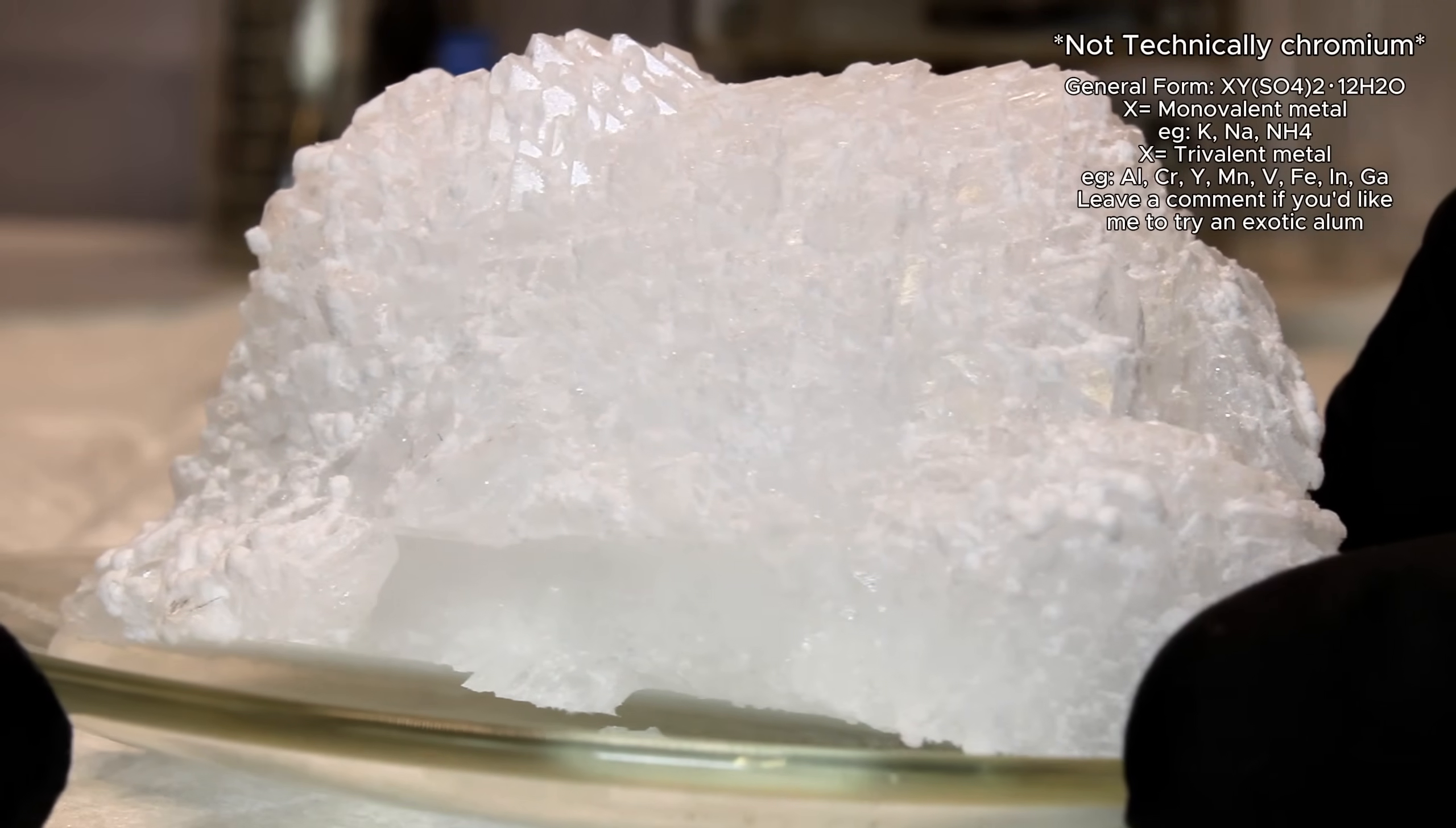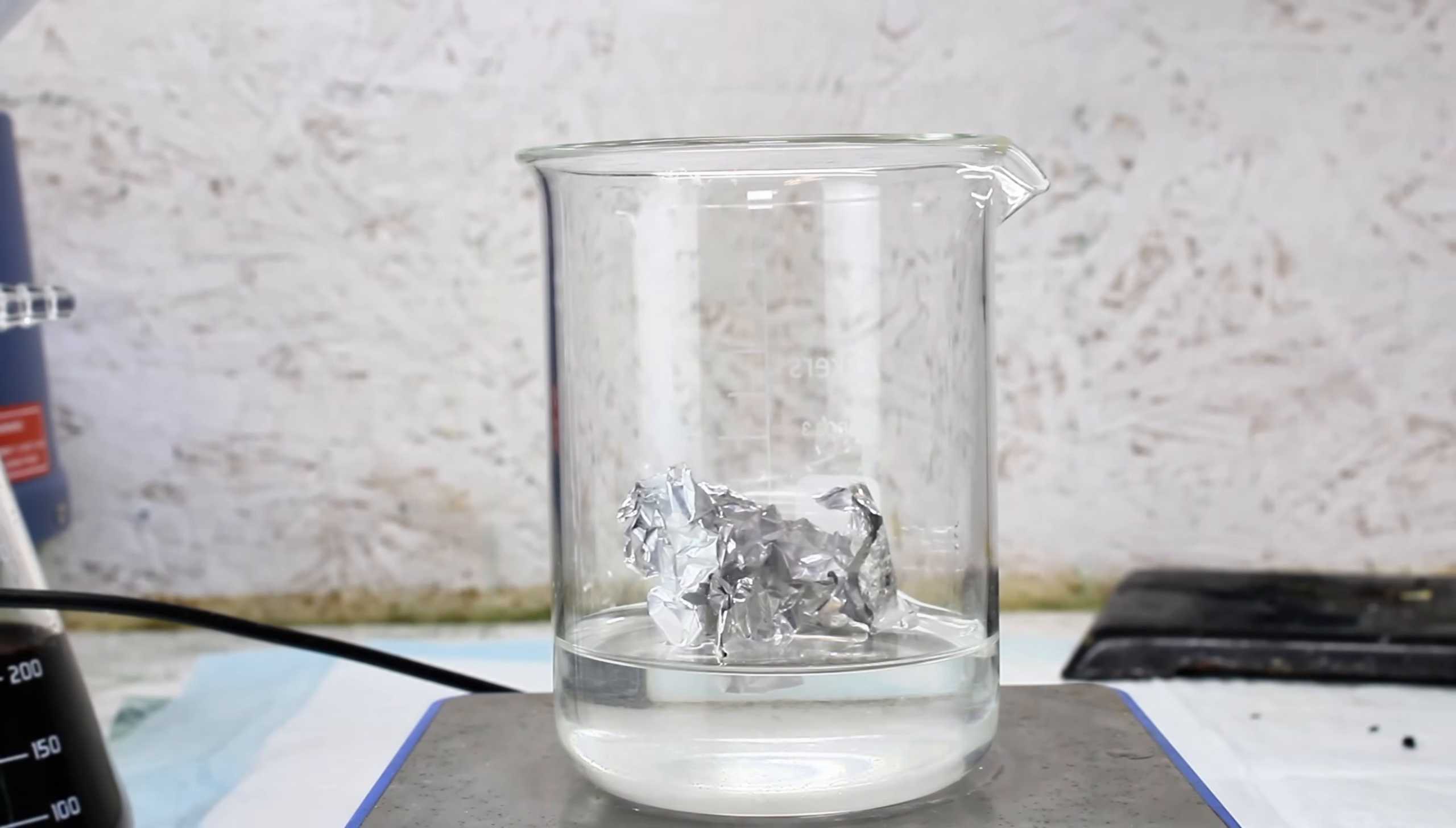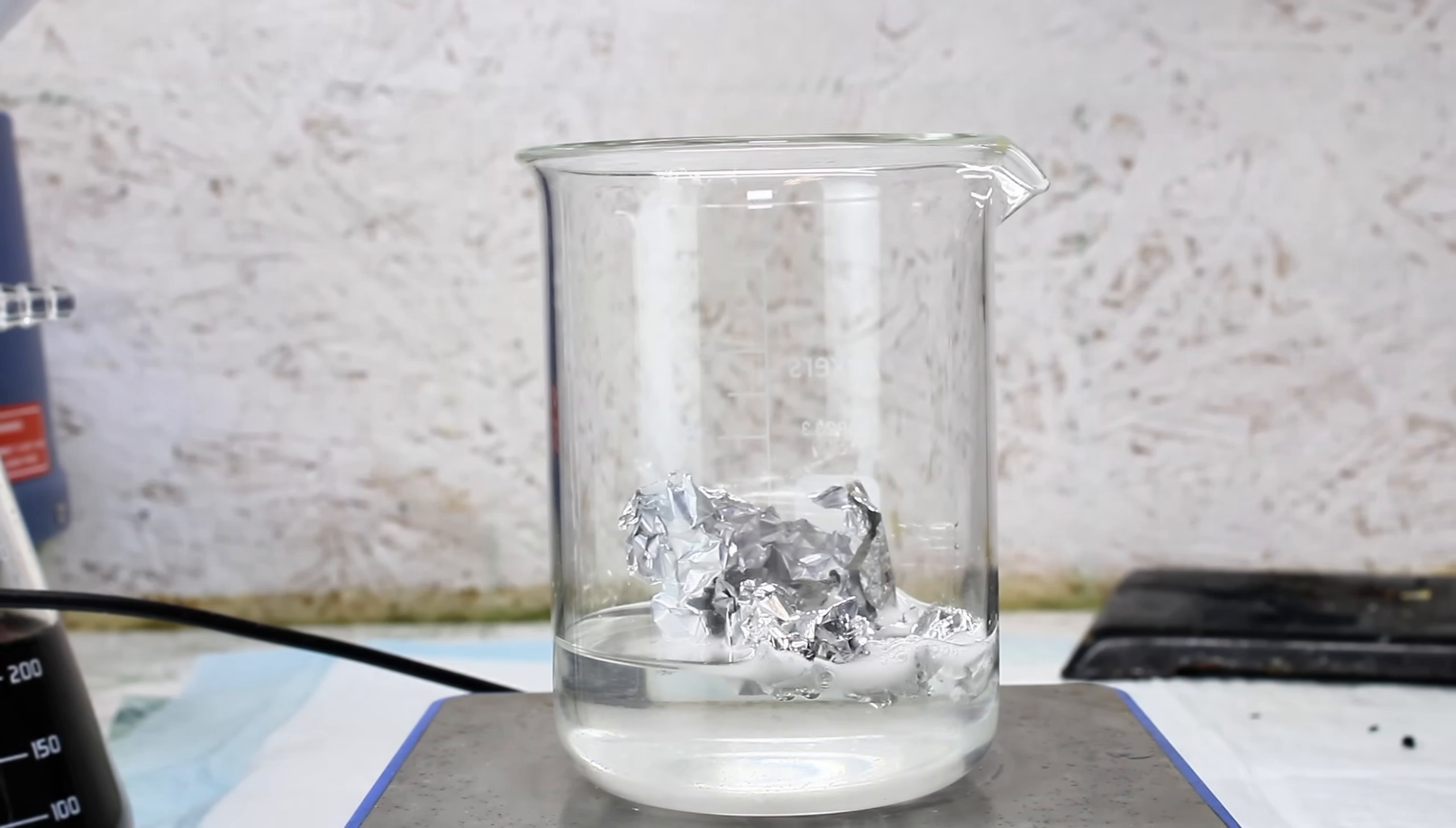Alum has an extremely long history of usage by humankind as a flocculant in cooking or water purification, and as a mordant in dyeing and leatherworking. I've used alum once before on this channel as a flocculant to precipitate cochineal red pigment, and at the time I promised I'd show how to make alum from scratch.